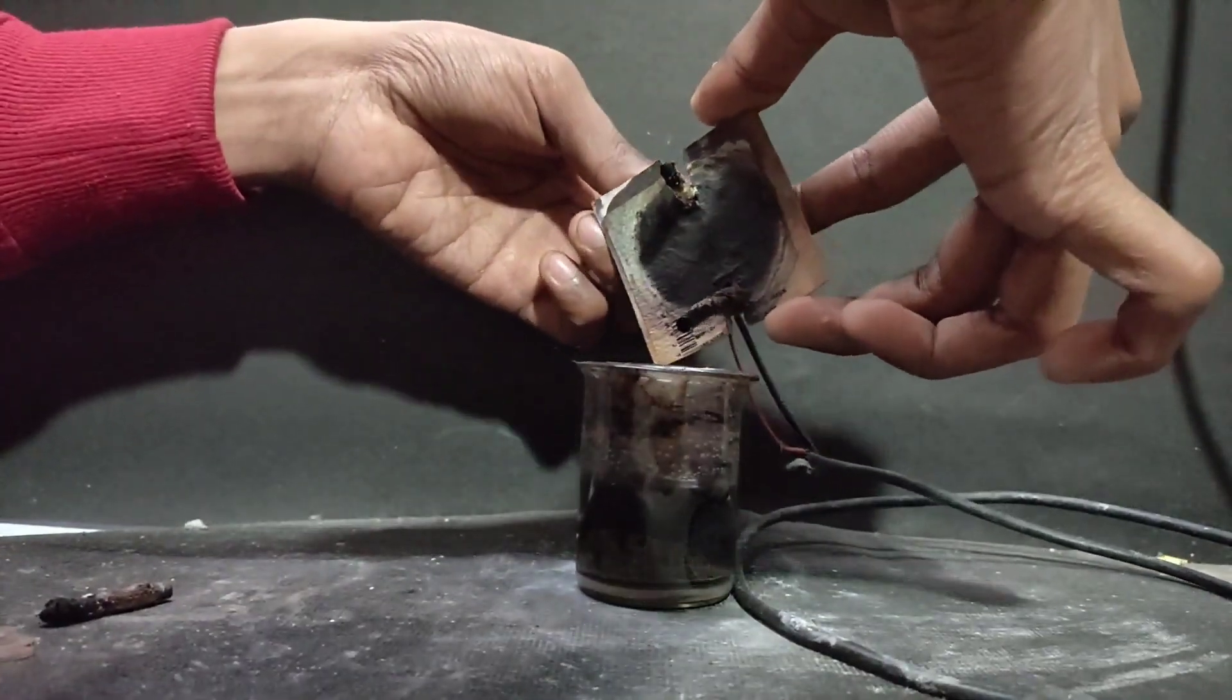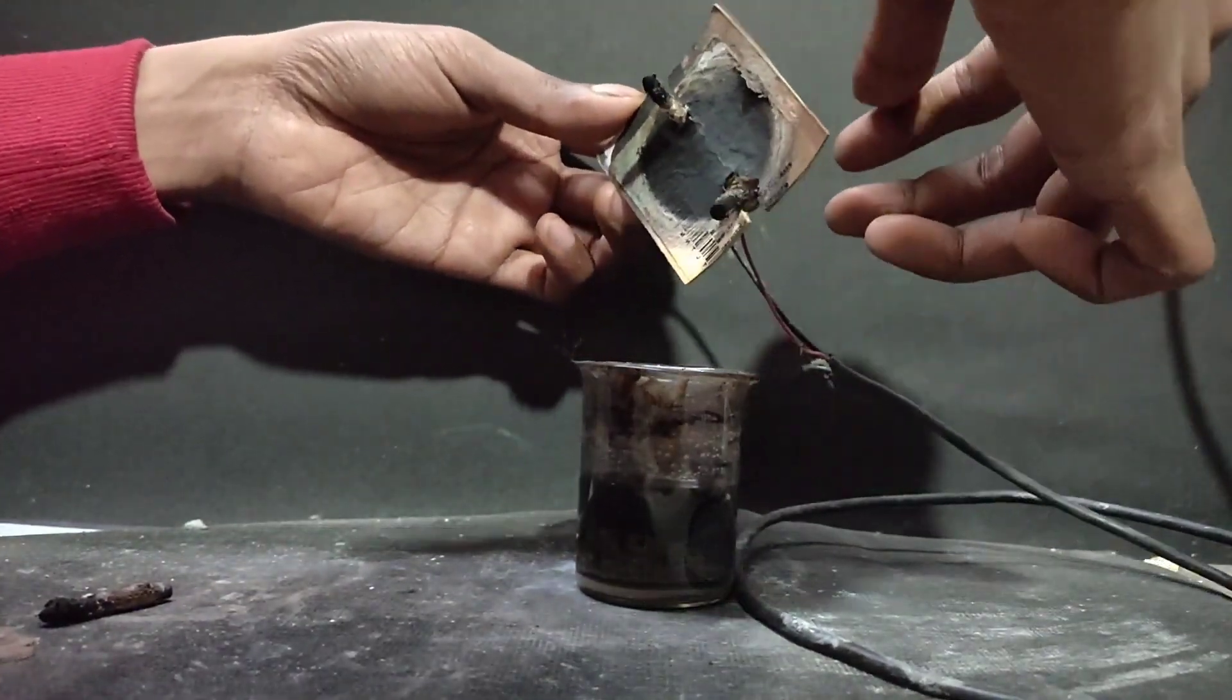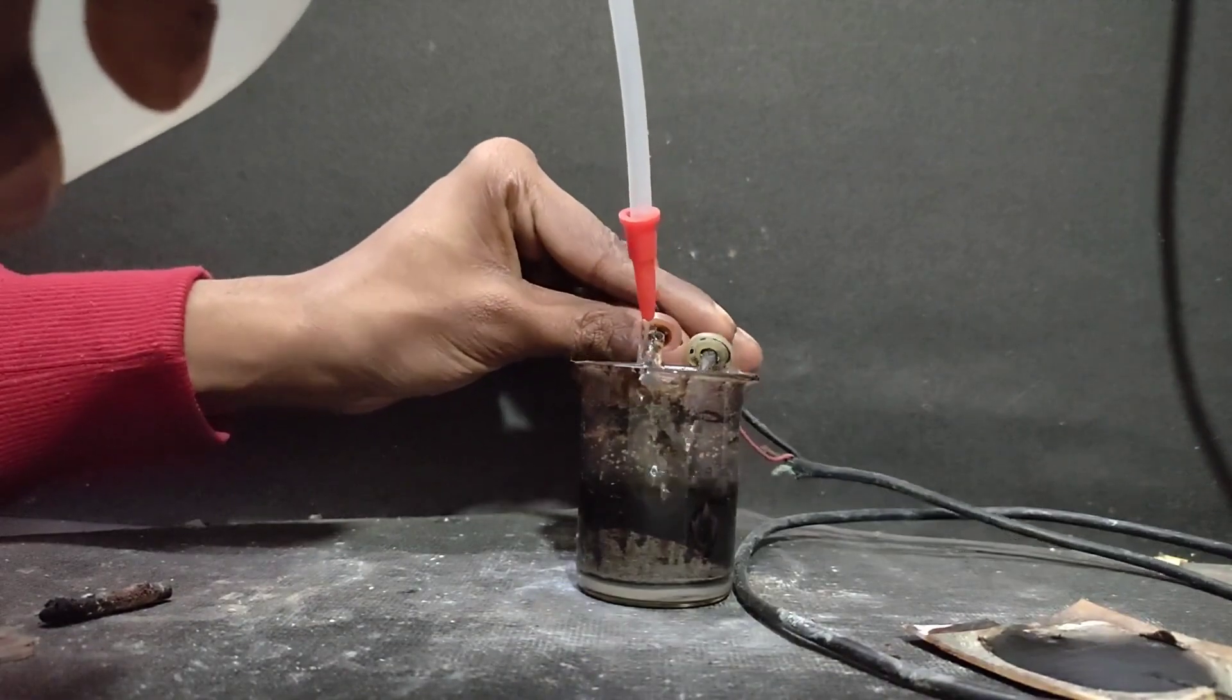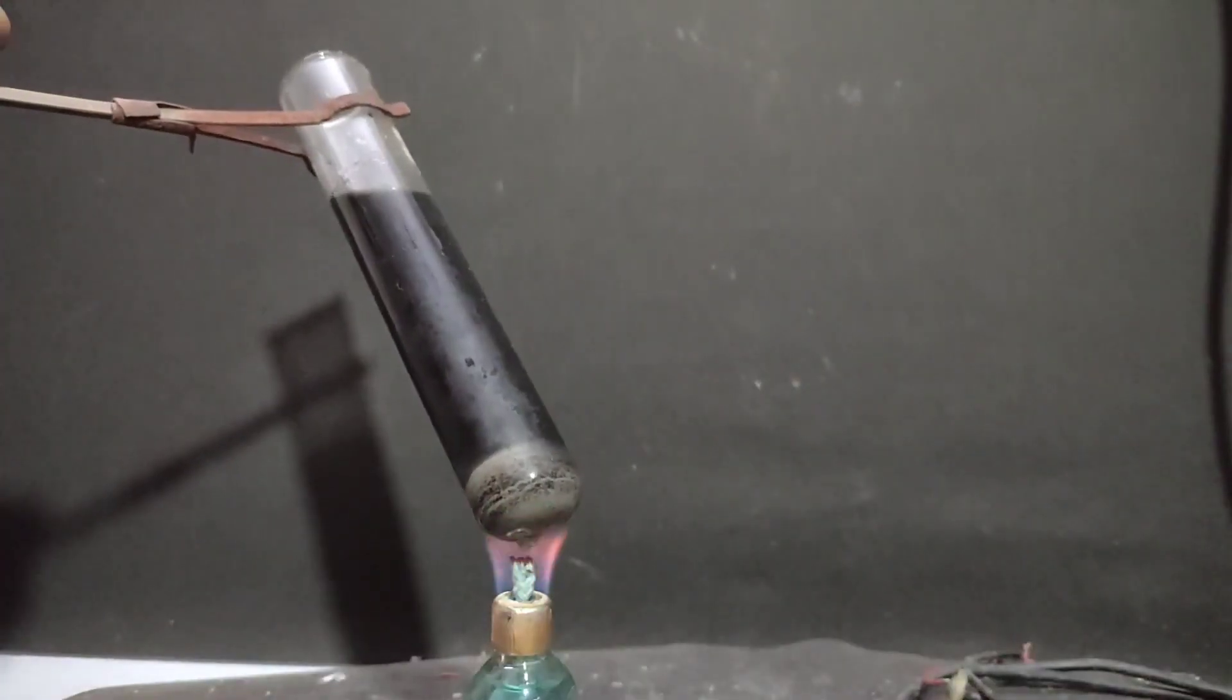So I replaced the anode and started electrolysis again. After a day, more solid was formed, but the anode had again disintegrated, so I washed them and took the whole solution in the boiling tube.